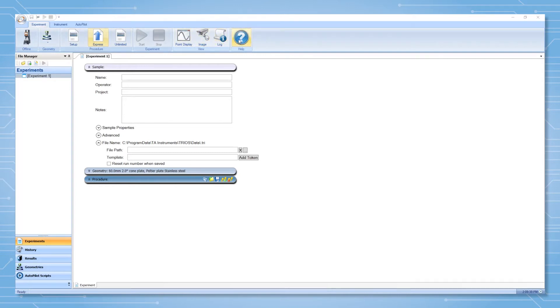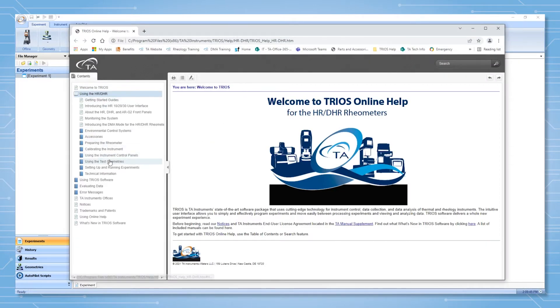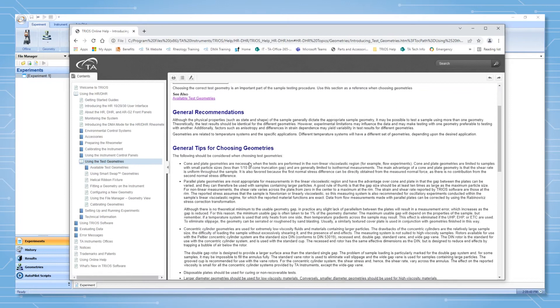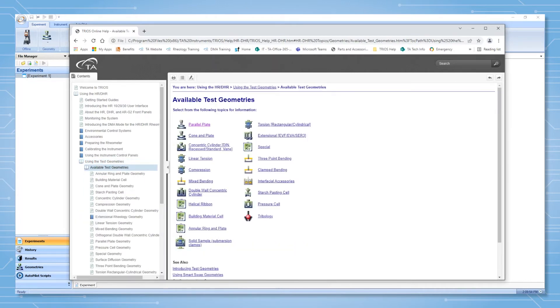From the instrument tab, you can navigate to the help by clicking on the question mark. Here you will find information on using the test geometries as well as geometry specific pages.